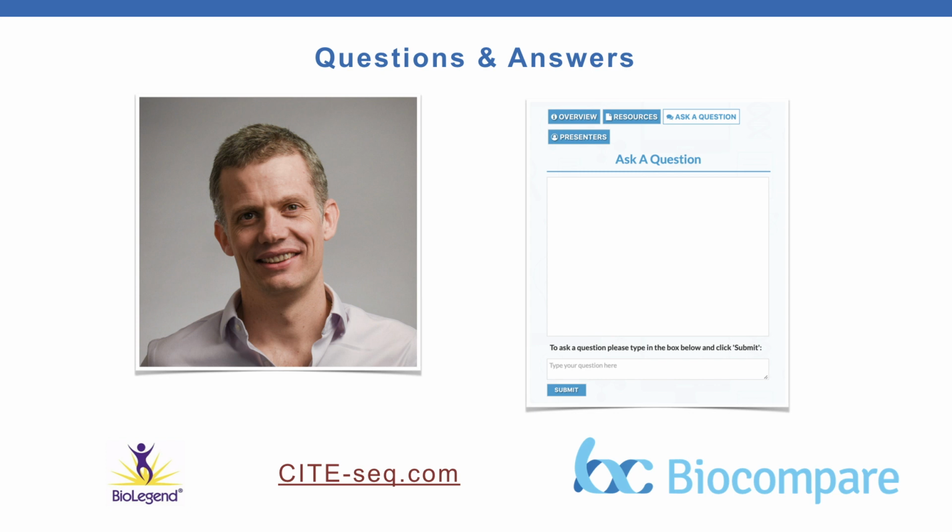Okay, thanks for that. The next question is, how do you perform titrations for CITE-seq? Good question. This is something we spent a fair bit of time on earlier. The problem is it's quite an expensive thing to do. So actually, this was part of the motivation for developing hashing in the first place, was that we could do a bunch of titrations and put them all together in the same experiment and the same sequencing run.